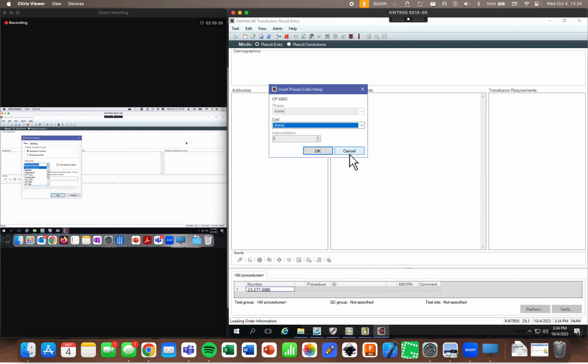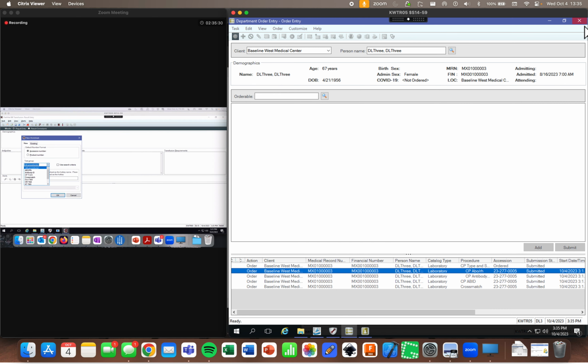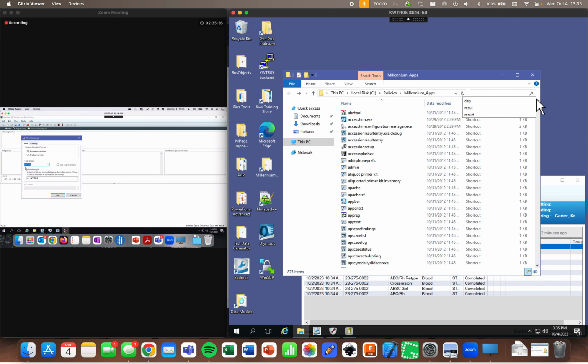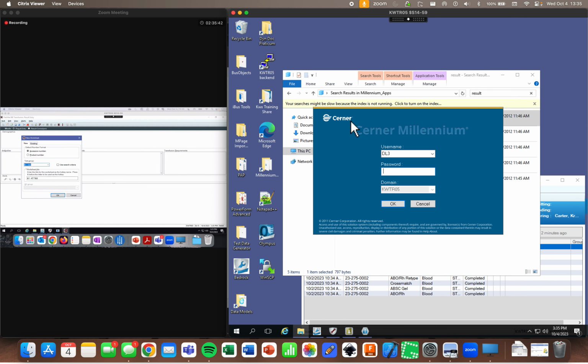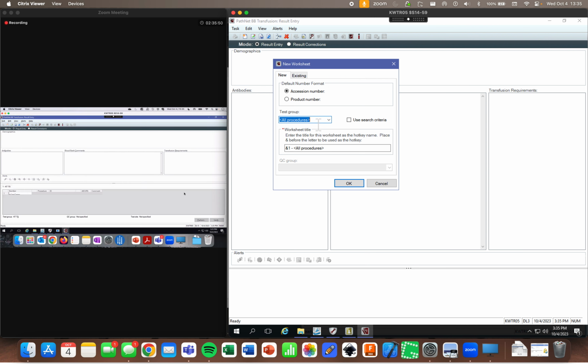Remember that grouping of orders that we put together? We want to select the one that we built. So there's mine right there. And then I click OK.